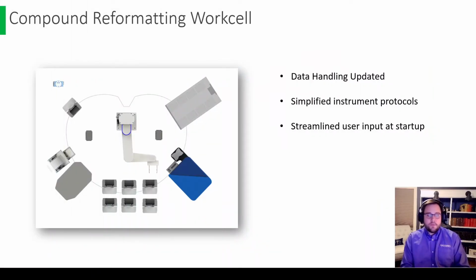So these next two examples are pretty related. The first one is actually the downstream assay of the second one I'll show you, but generally what we need to know for both of these work cells is that they were doing everything they needed to do already. The main issue again was that the computers they were running on were running Windows 7, and the overarching scheduling software that this system used is no longer supported on Windows 10.